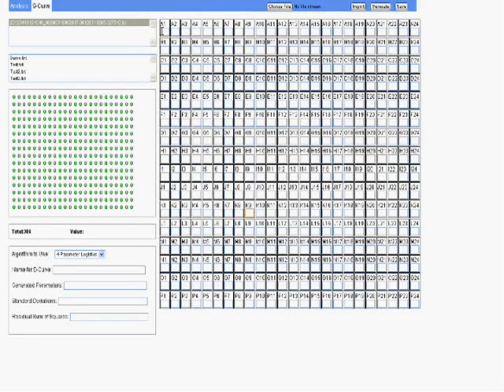And so I've made a control curve here, so we'll just use that, and I'll just make a dummy curve right now for demonstrative purposes here. And so you can import the values as you go.